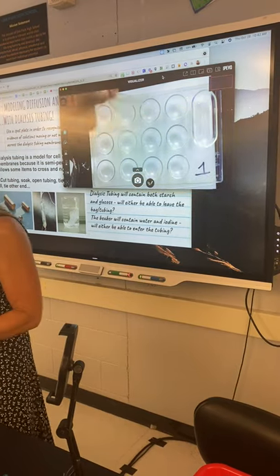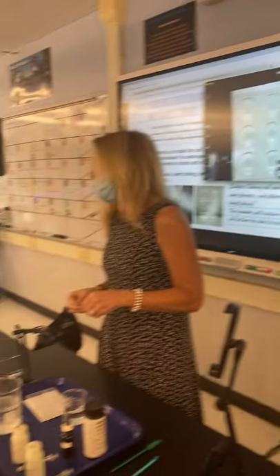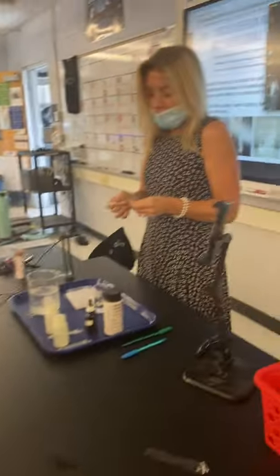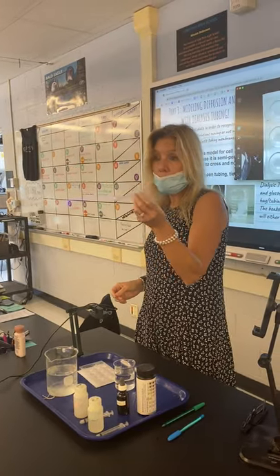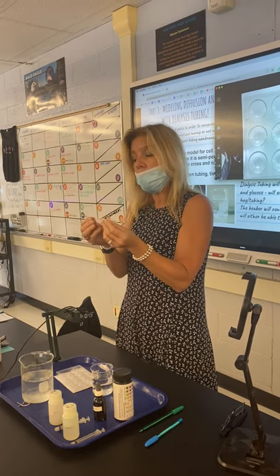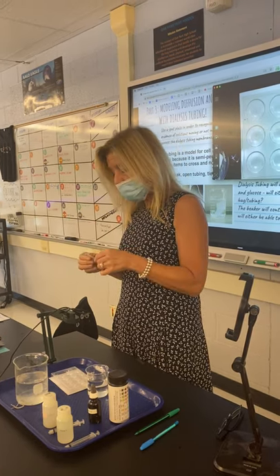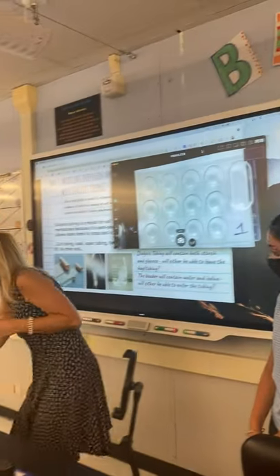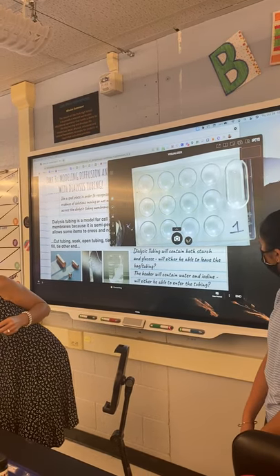I'm going to need you to help me tie some string. I'm grabbing you because I know you don't care if I put you on social media. So once you have it, what we're going to do is use this to model a cell and look to see what solutions can move, because remember it is a semipermeable membrane — some things can pass through and some stuff can't. So in order to learn how things are moving, I have a demo on this spot plate.